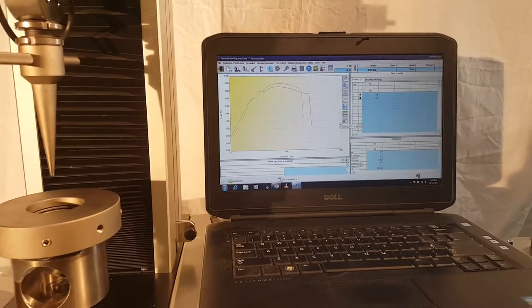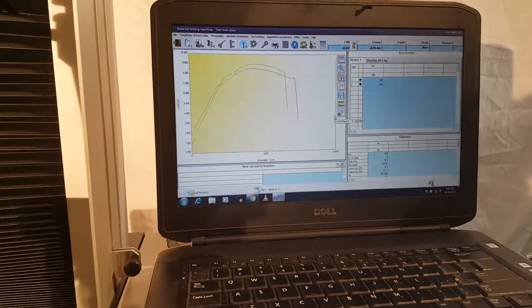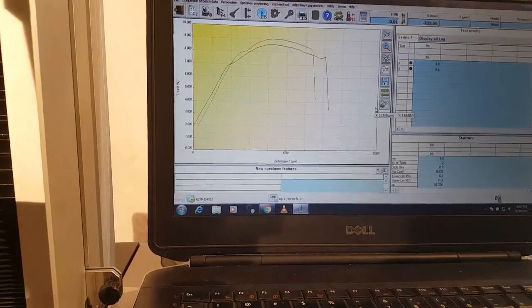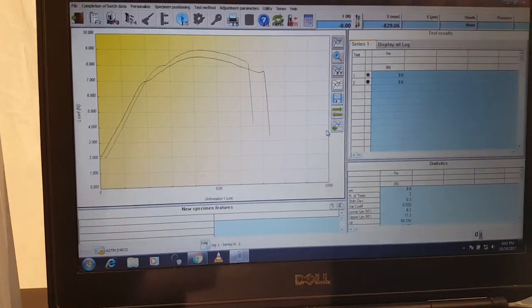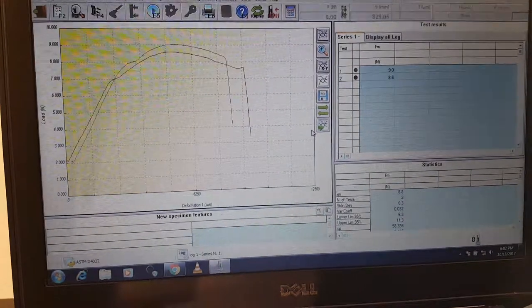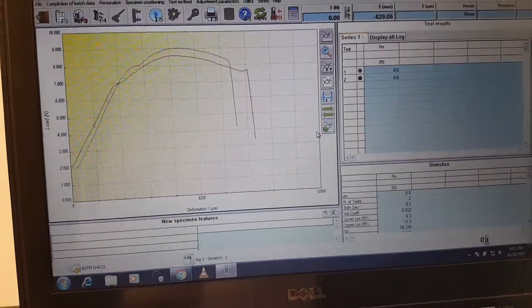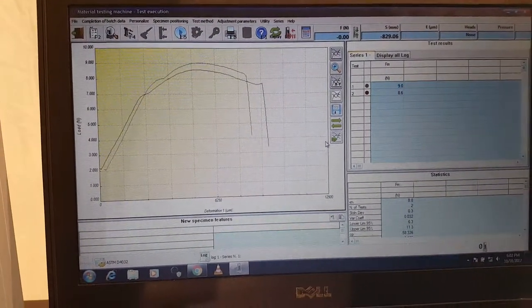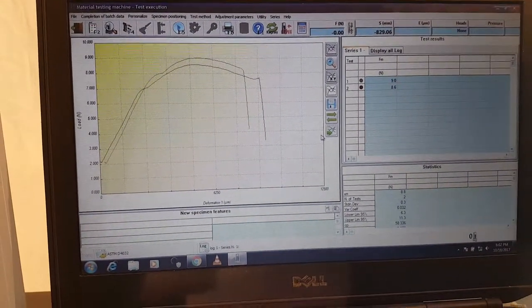Alright, we'll take a look at the data here. It's pretty similar to the last test. Both are showing right around nine newtons, which is a little under two pounds.